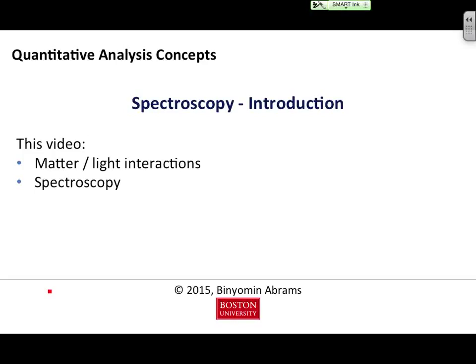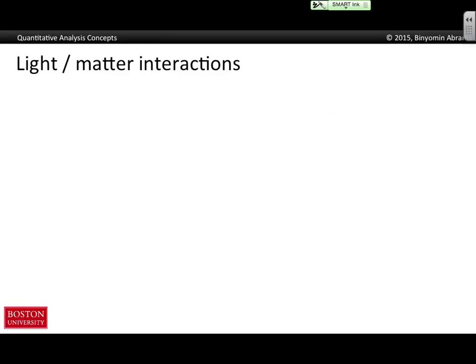In this video, we're going to give a quick introduction to spectroscopy. Spectroscopy is a very important analytical instrumental technique that's used in experimental chemistry and experimental physics. Spectroscopy can be summed up by the term light-matter interactions.